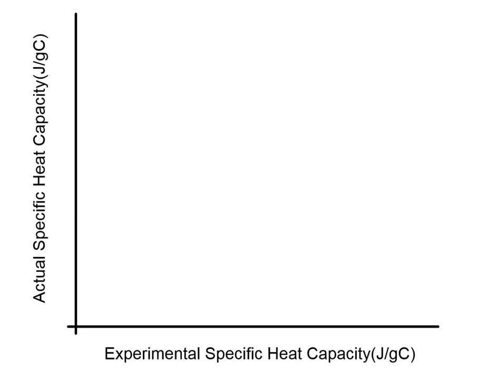Alright, this is your video for your specific heat capacity lab. In it, you're going to use a process called calorimetry to determine what the specific heat capacity is for an unknown metal. You're going to have a little piece of metal and you're going to put it in a coffee cup calorimeter and use that to determine what your heat capacity is for that metal. You will be doing that with 4 other metals of known identity.